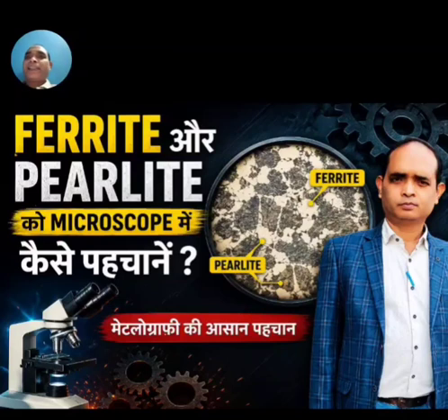Pearlite is not a single phase, it is a mixture of ferrite and cementite arranged in alternating layers called lamellae. Pearlite forms during slow cooling of austenite at the eutectoid temperature of approximately 727 degrees centigrade. Because cementite is very hard, pearlite is harder and stronger than ferrite.